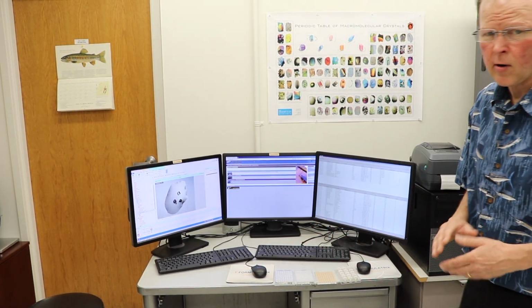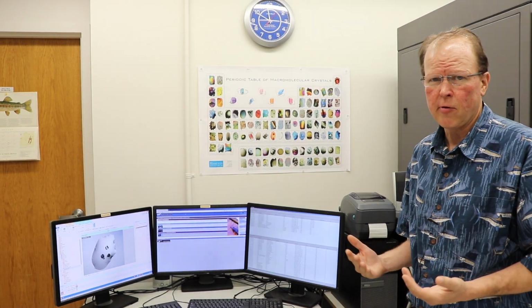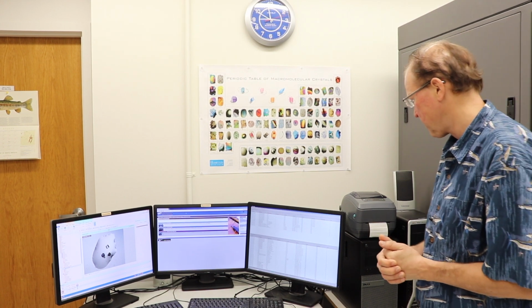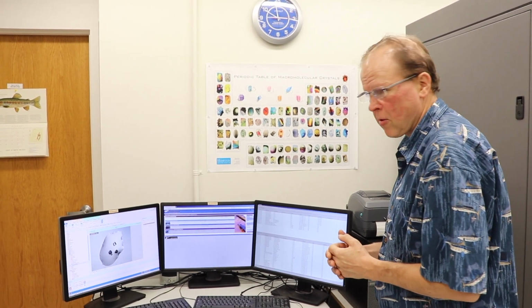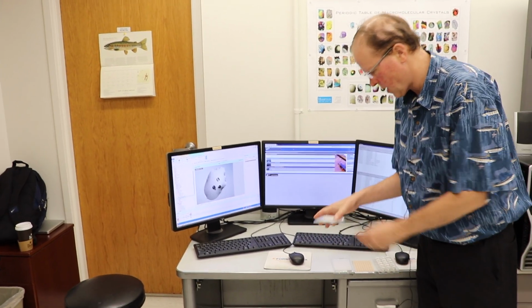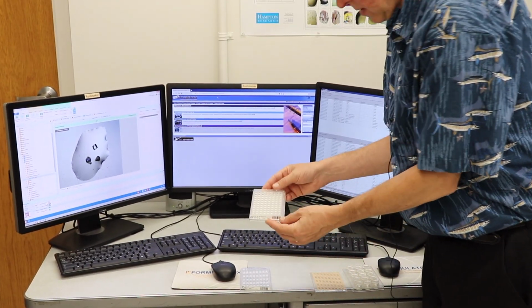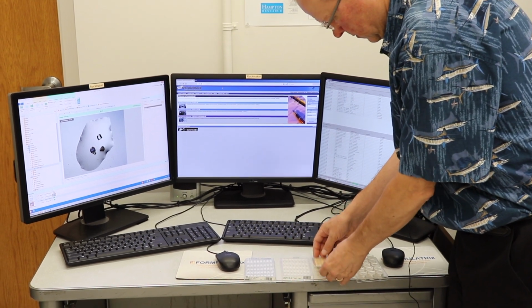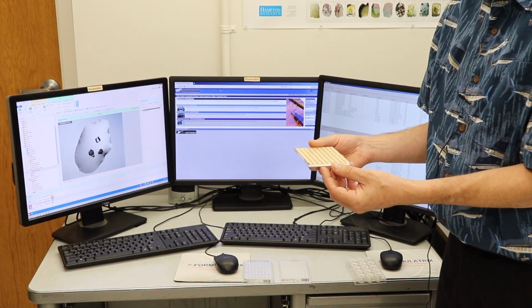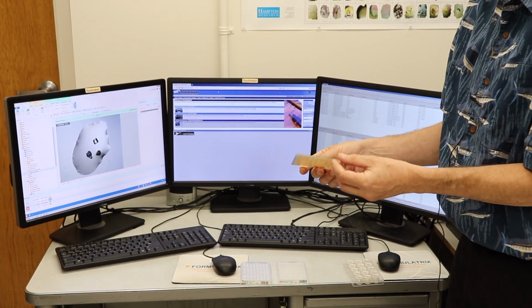This allows you to look at your crystallization experiments and move them into PowerPoint or another appropriate program for your records, or to create a presentation on crystallization conditions. RockMaker is quite versatile, or the RockImager is quite versatile. It can handle standard hanging drop experiments, sitting drop experiments. It can also handle LCP plates for doing integral membrane proteins and doing fluorescent imaging for an experiment called FRAP.